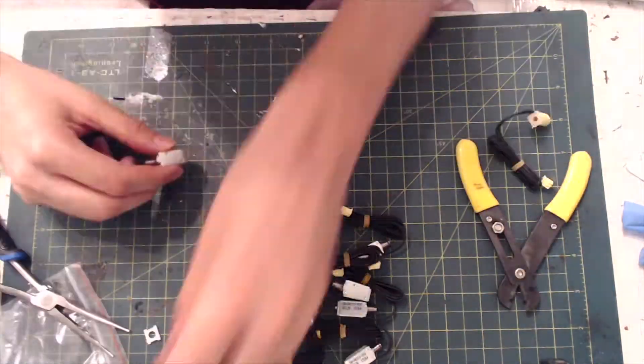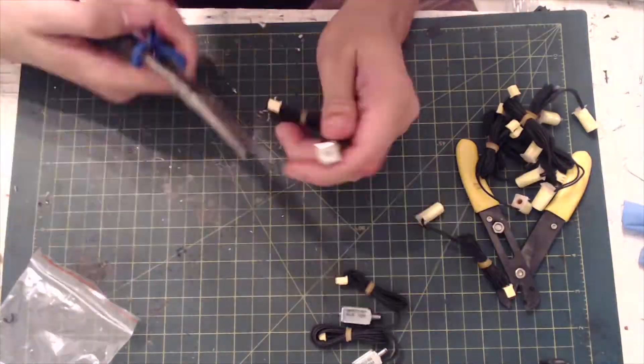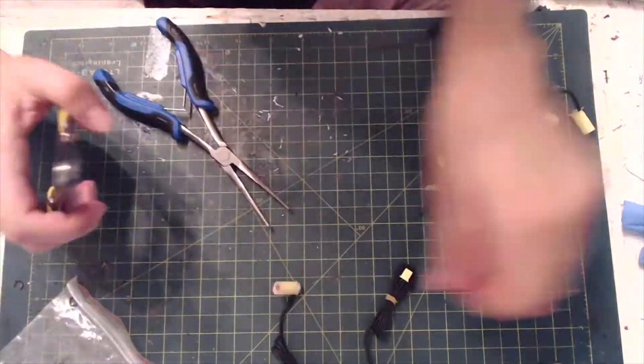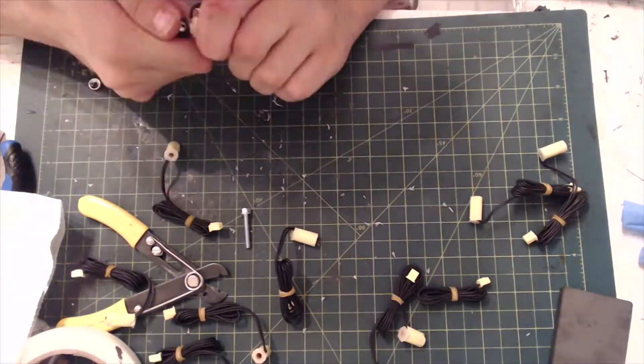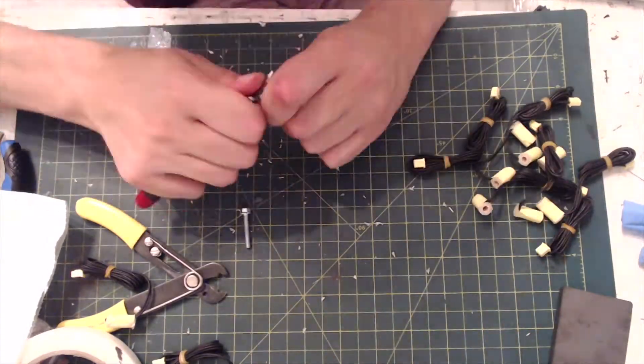Instead of wrapping my own electromagnets this time, I decided to use the cores of micro solenoids that were already on the market. Since the cores themselves are not available for purchase, I instead had to disassemble the solenoids myself.